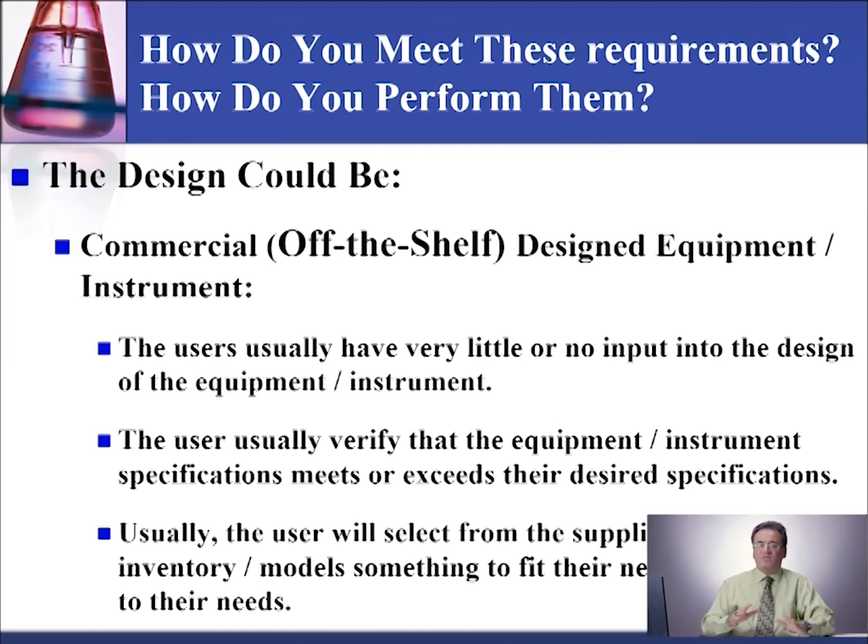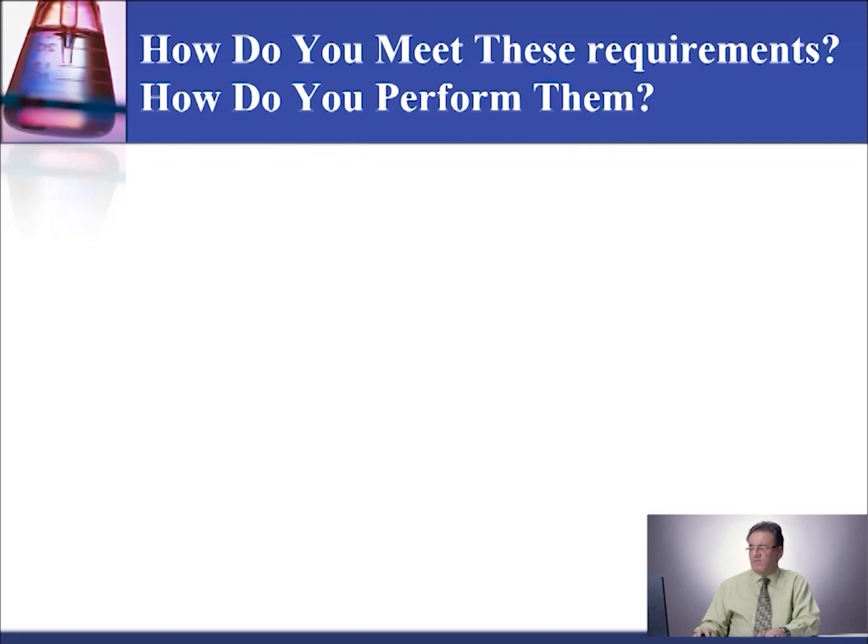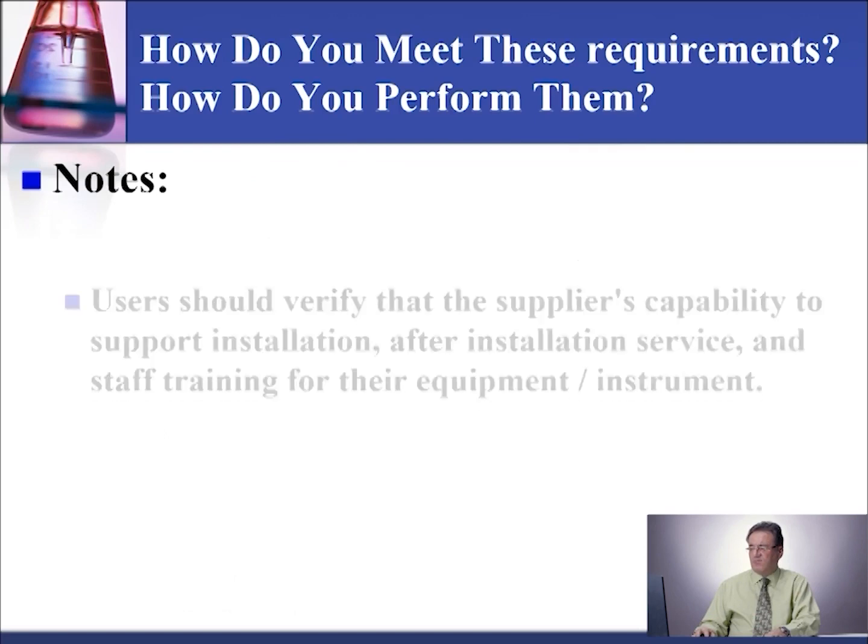You need to do training for the applicable staff. The applicable staff are the staff who are going to be operating this machine or instrument. Training needs to be detailed and documented on a training checklist, initially done by the vendor, later by a trainer who is trained by the vendor.